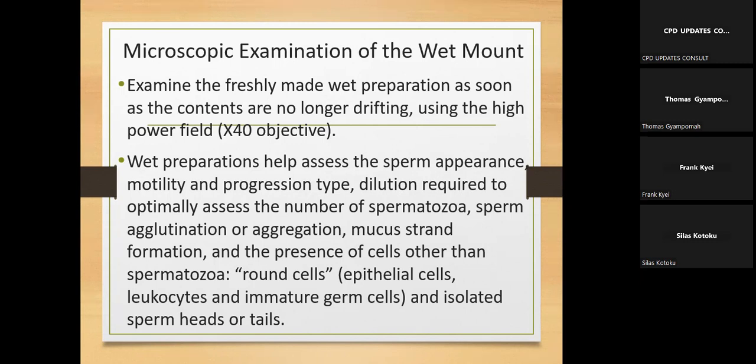You know that in microscopy, magnification is the objective times the eyepiece. Eyepiece is usually fixed. Oh, 400. That's good. So Silas, that's good. Thank you. Okay, so without 2 Camellia, I'm sorry, I didn't see that one. So that's 400. Since all of us are senior men, I'm supposing. So this is when students come around. These are the small things you should be able to let them know.